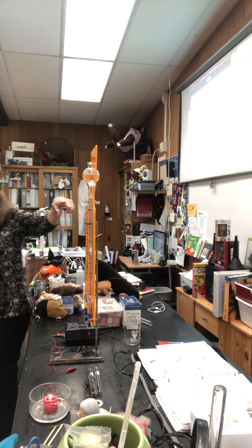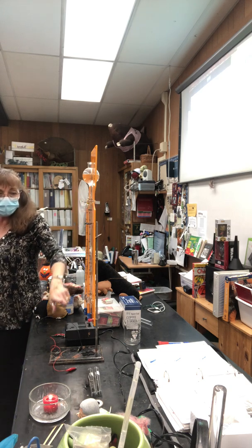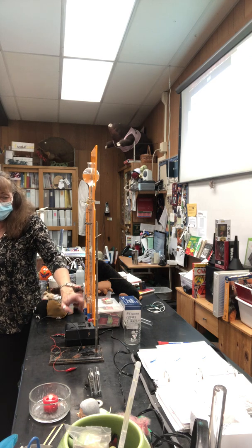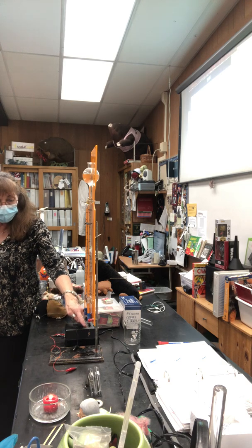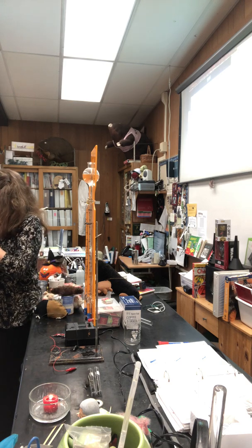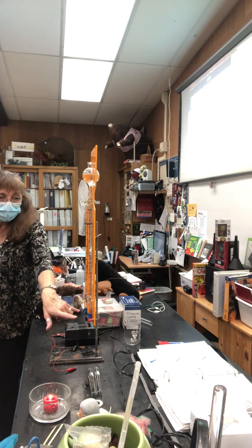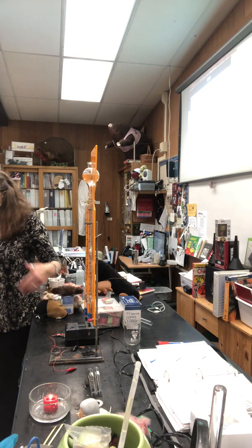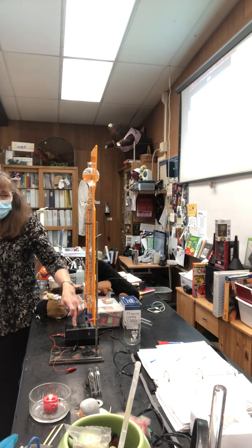So this apparatus is called the Hoffman apparatus. It has an orange background just so you can see it better. There's stoppers and these little electrodes. They're actually glass, but there's copper wire in the glass tubing, and it comes out this end. And then there's a piece of platinum at the tip of them connected to the copper wire. You'll notice there's red and black. That has to do with the electrodes, and by tradition, the red electrode is the positive, the black electrode's the negative.